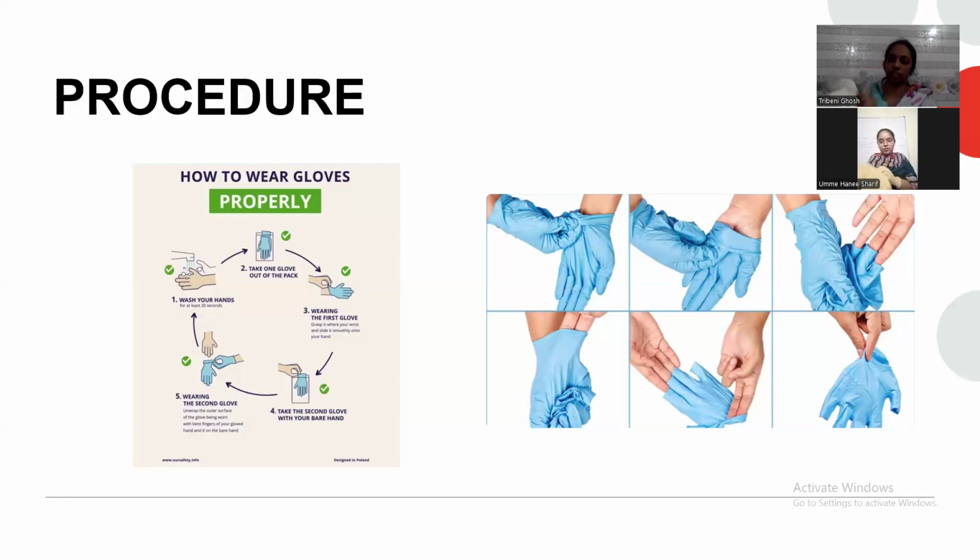Okay, just let me put on your gloves like this. We just skip the sanitizing part. It's okay. I just want to learn how to take it off. Put off, docking, I think. Yes, doffing. It's called doffing.